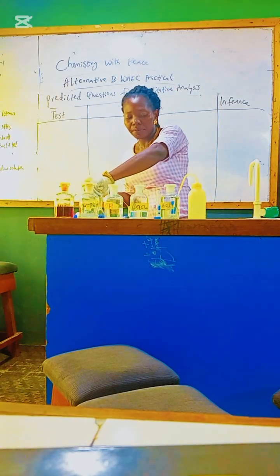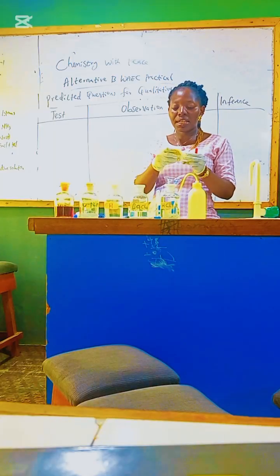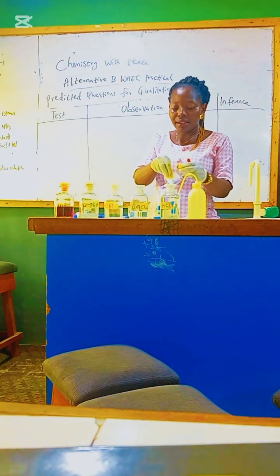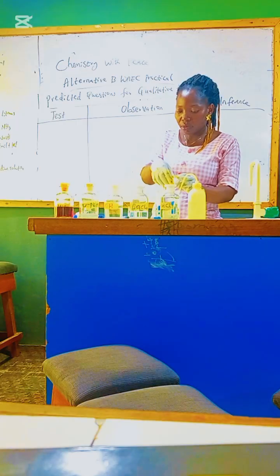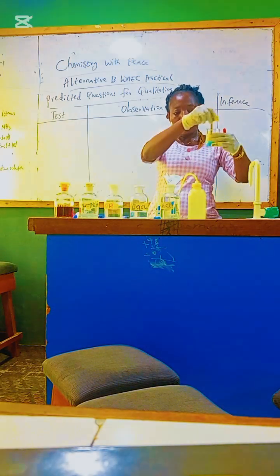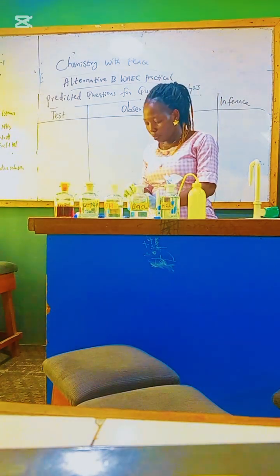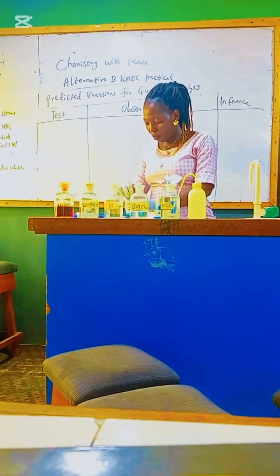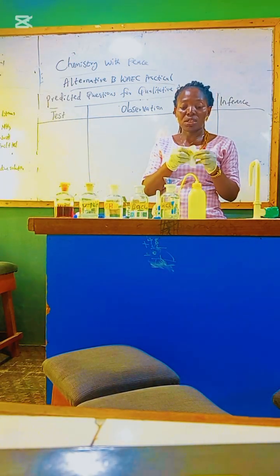They say add in a test tube, stir very well, and then filter. You stir very well so that it will dissolve.